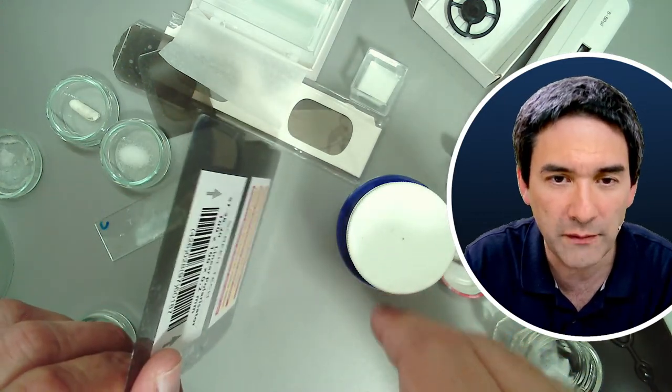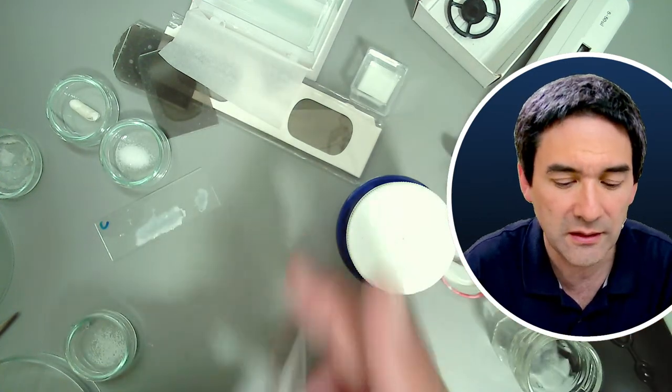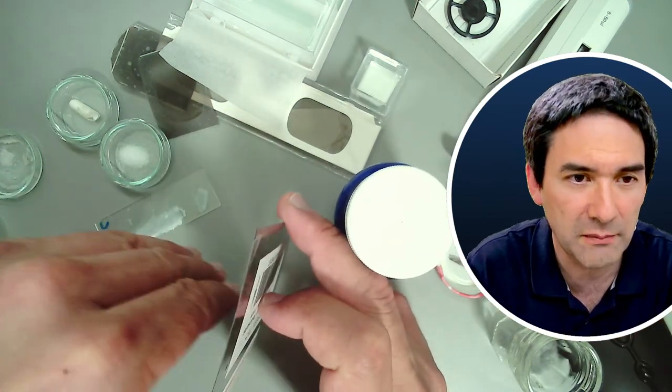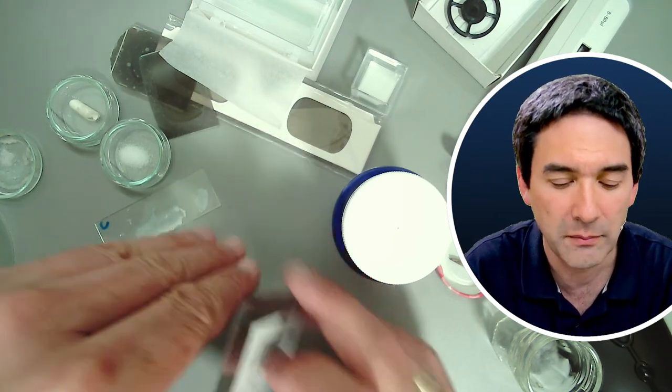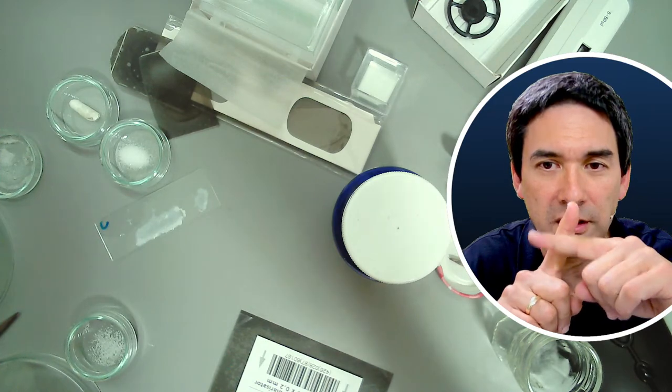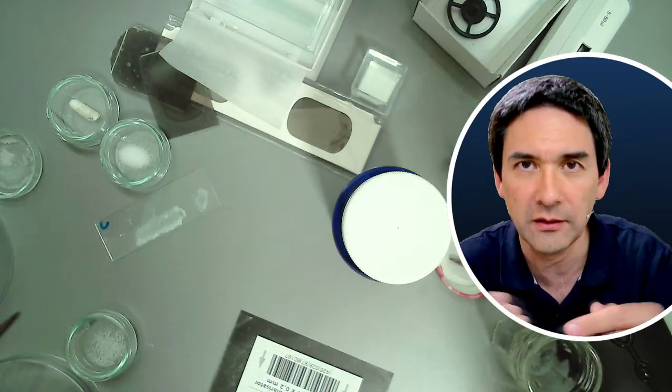And now if you have another filter on the other side where it's turned 90 degrees, then this light is not able to go through, right? And then it's black. So if it's in what you call a crossed position, then it blocks all of the light, and no light is able to go through.